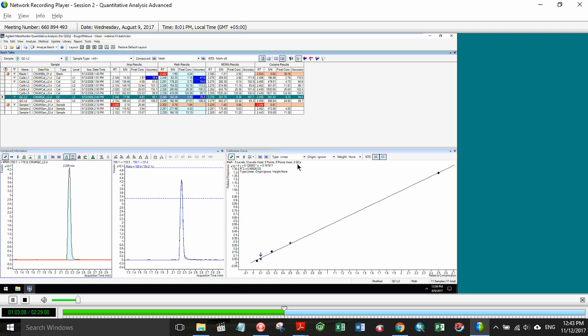And just quickly, what is the path for upgrading? Do they just contact their informatics specialist, or their local account manager? Just contact them, say you'd like to upgrade, and they can send you a quote for the upgrading of the software.